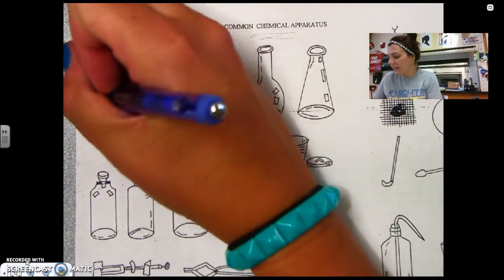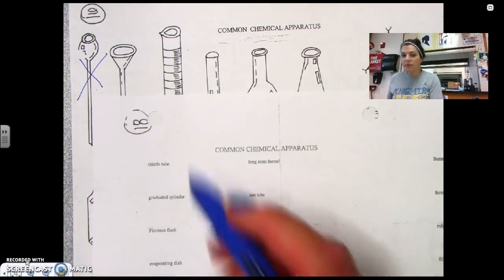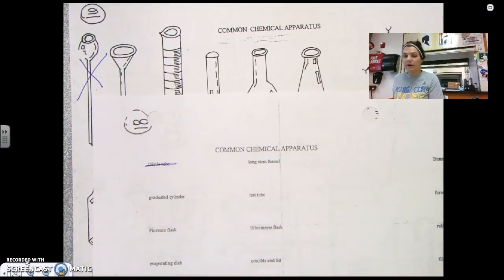This first thing here is the thistle tube. By the way, these notes are on page 16. This is a thistle tube, so we can go ahead and cross that guy off. We're not going to talk about him.